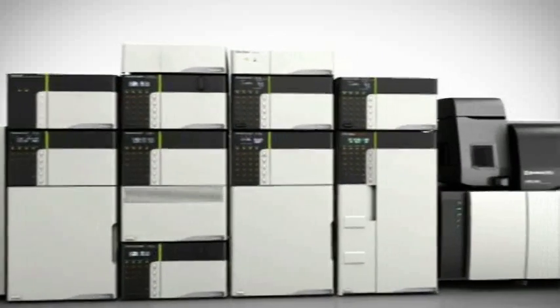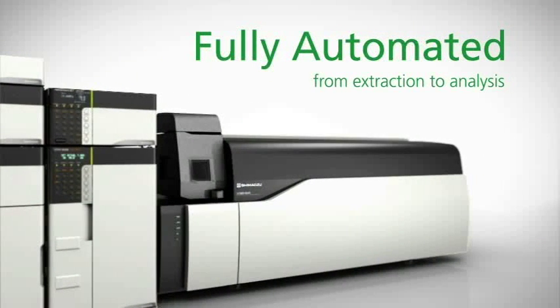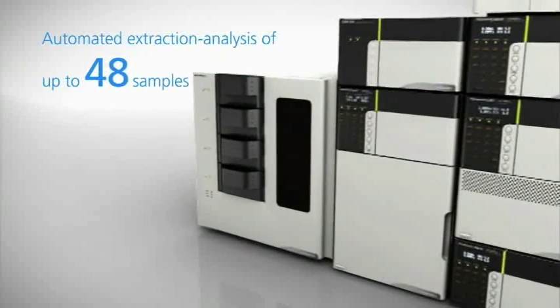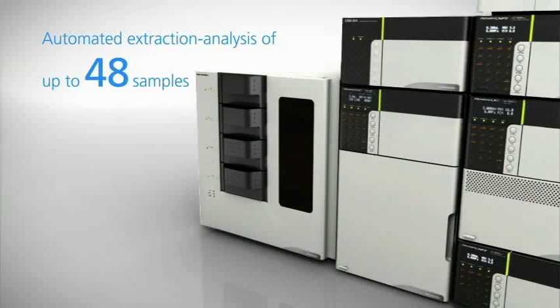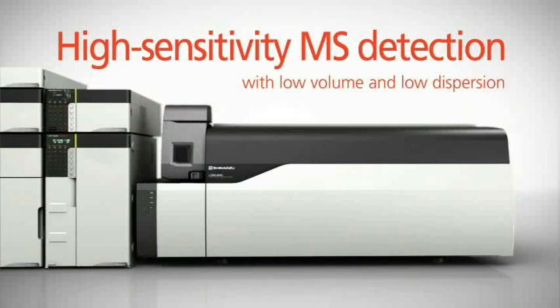Process automation from extraction to analysis to instrument shutdown can be achieved with Nexera UC. Up to 48 samples can be extracted and analyzed using high sensitivity UF-MS detection, enabled by the new low-volume back pressure regulator.